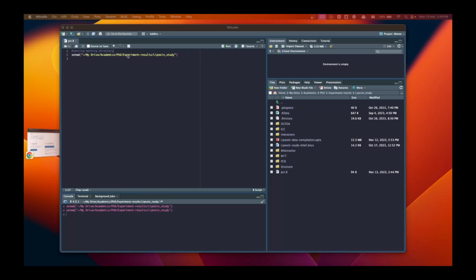All right. So first, when you start writing codes in R, there's something called base R. You get some functions out of R itself. They are inherently there inside R once you download R Studio and you install R. But we also need some other packages. We need some other functions which are in some other packages which do not come with R inherently.